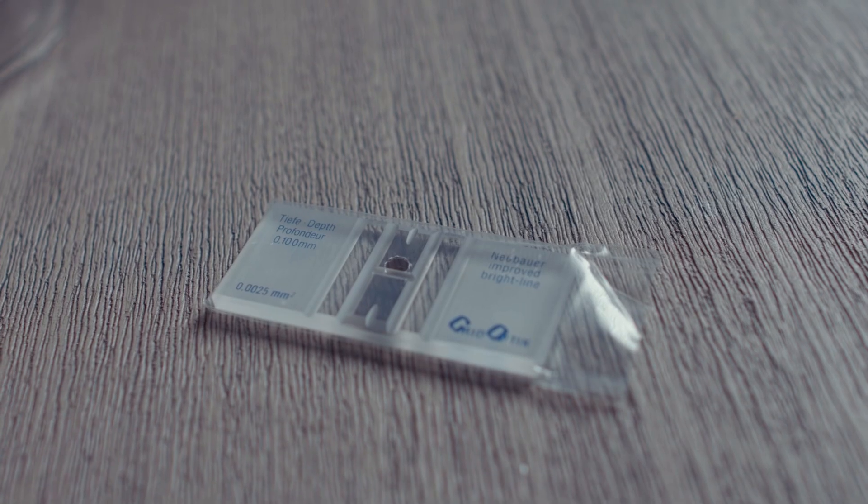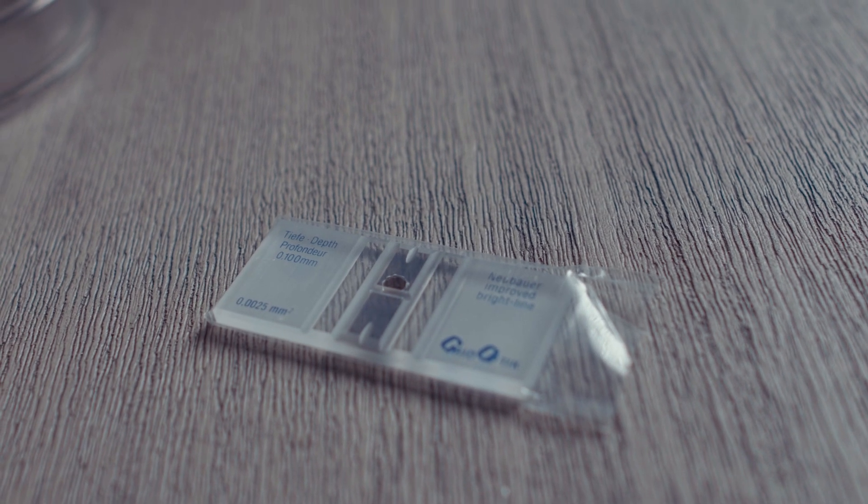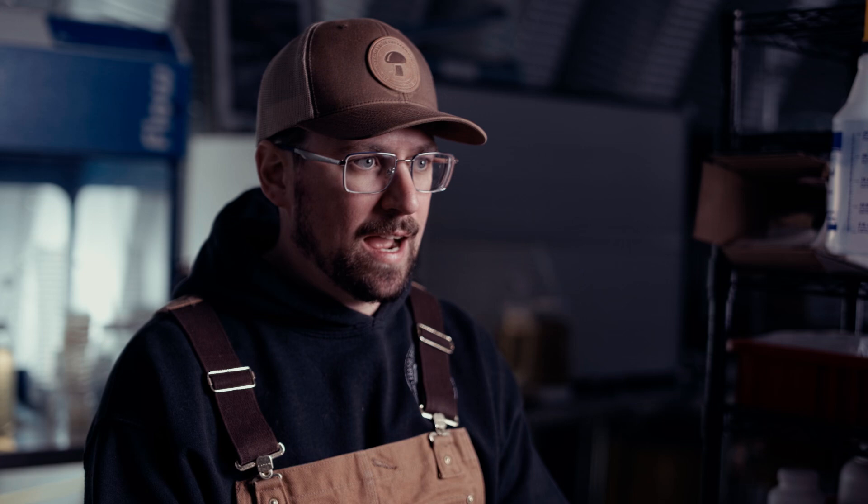One useful tool for counting spores is a hemocytometer. This is a glass slide that has etched-in grids to help you orient yourself under the microscope. The first step is to take a drop of your spore syringe and put it onto your hemocytometer. Hemocytometers come built in with two chambers to average out the counts from both sides, making it more accurate. Put a drop on one side and a drop on the other side, and wait three to five minutes until those cells settle to the bottom of the slide.